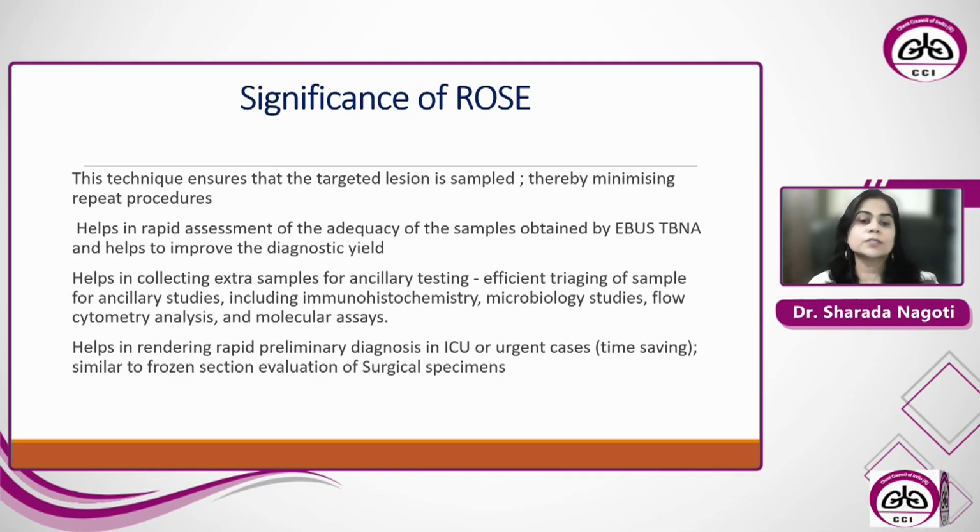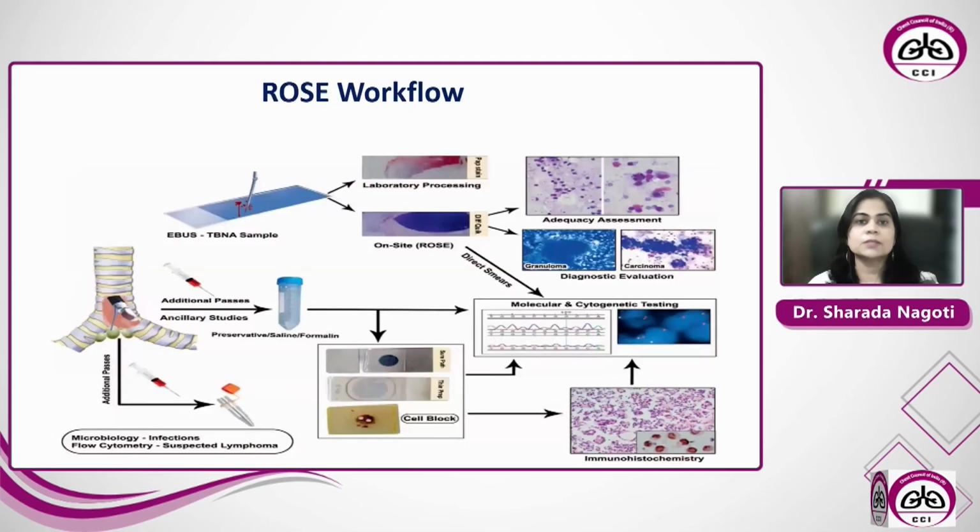Hence, it is similar to frozen section evaluation of surgical specimens. Coming to the ROSE workflow, this is a picture demonstrating the ROSE workflow. The EBUS TBNA aspirate is expressed onto a clean labeled glass slide and a smear is made. These smears are either air-dried or wet fixed, that is, fixed in an alcoholic fixative.